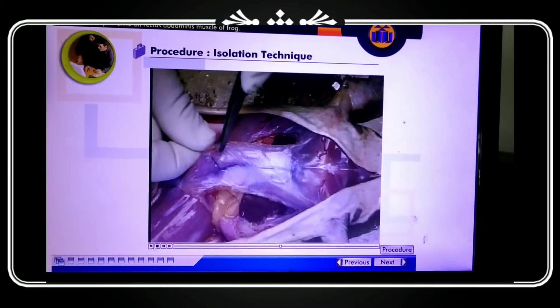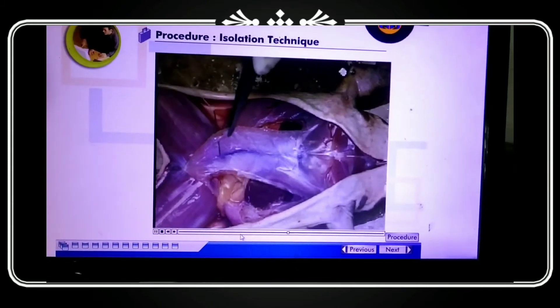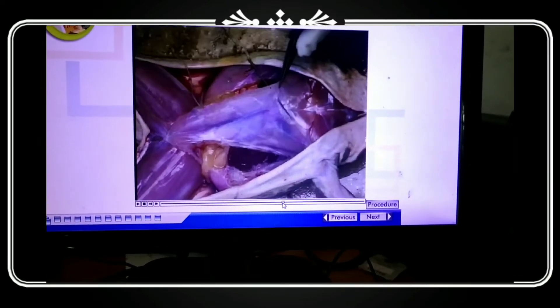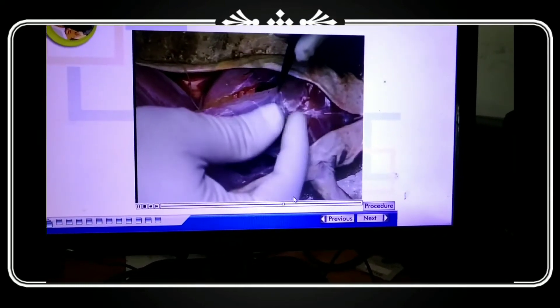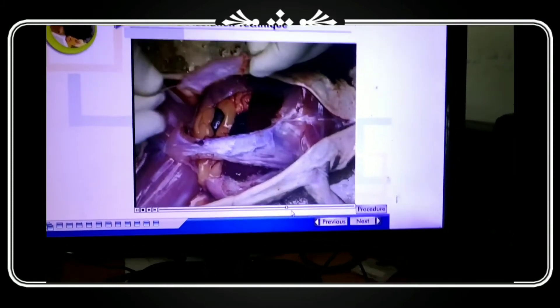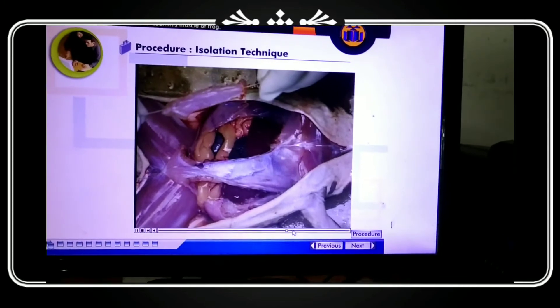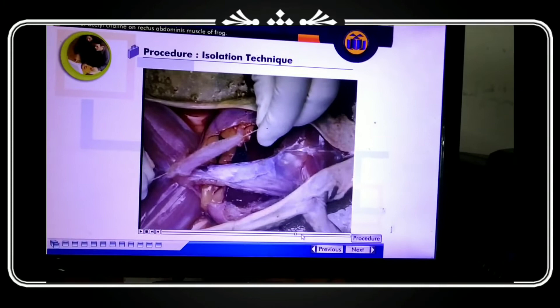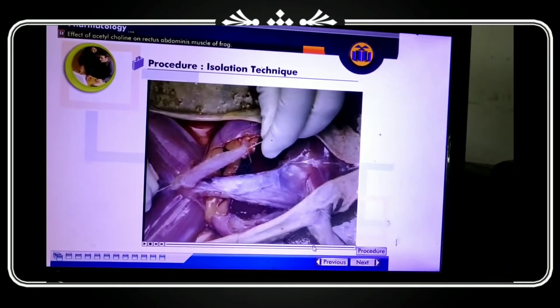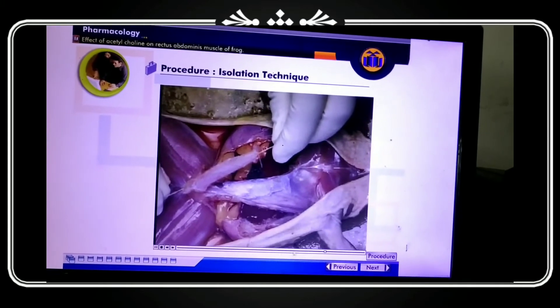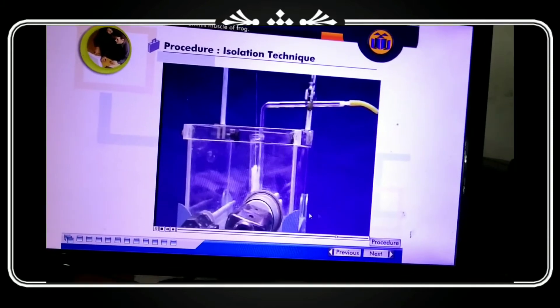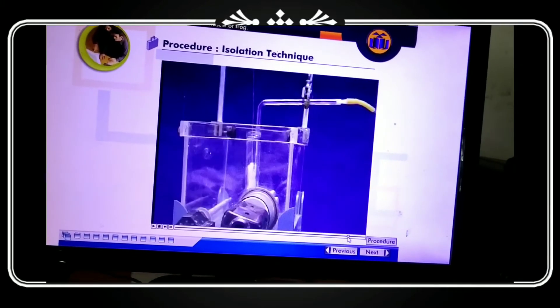The muscle is separated carefully. We cut the muscle in this way — this is the resection method. With the help of needle and thread, we tighten the thread on both sides and bind the tube. With the help of the frontal writing lever, we will maintain the recording on the rotating drum.